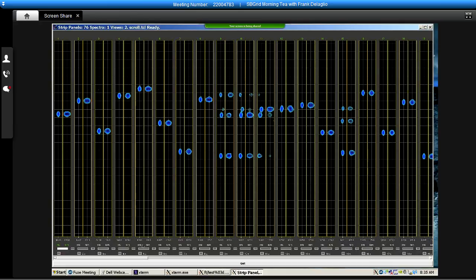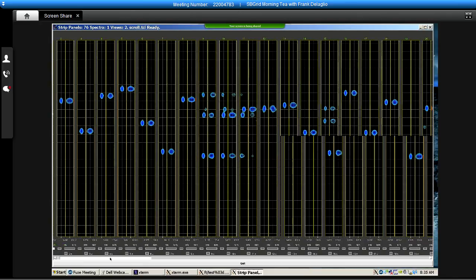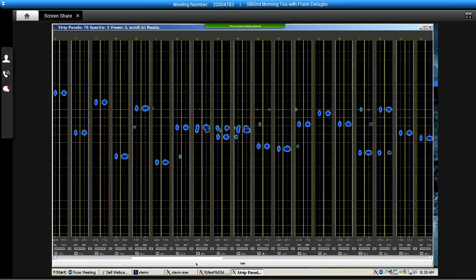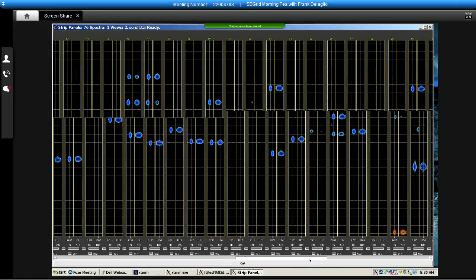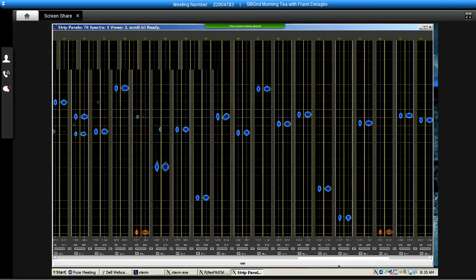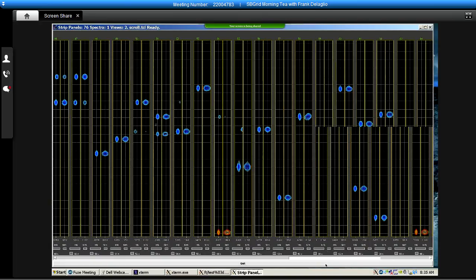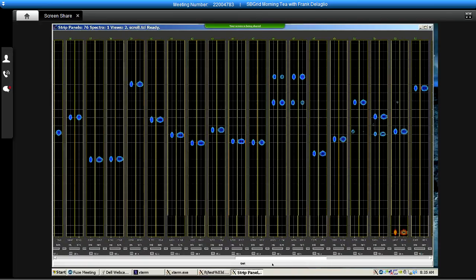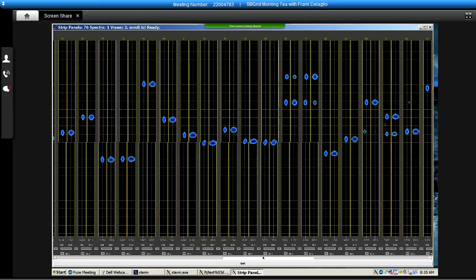And here's what that result looks like. In this display, I see pairs of strips at all the positions where we were able to find the peak in the 2D projection. This is a nice way to get an overview of the entire 3D spectral result and see what the line shapes look like in all three of the dimensions.